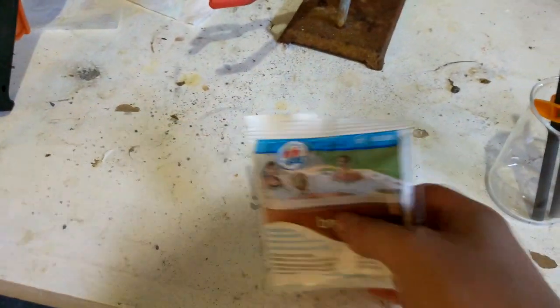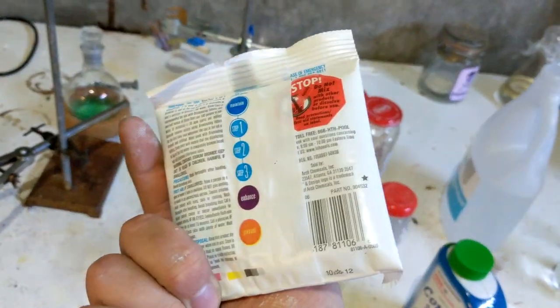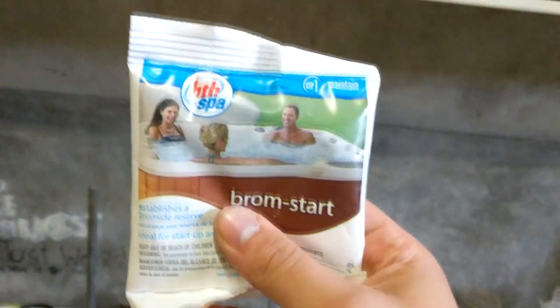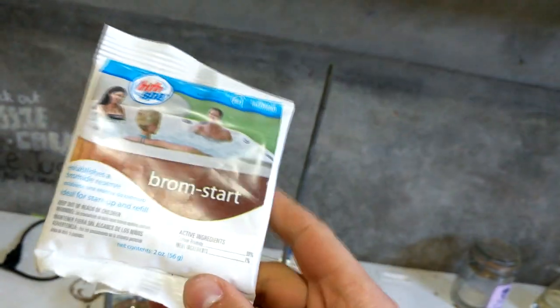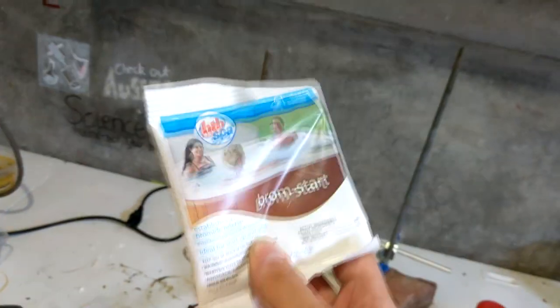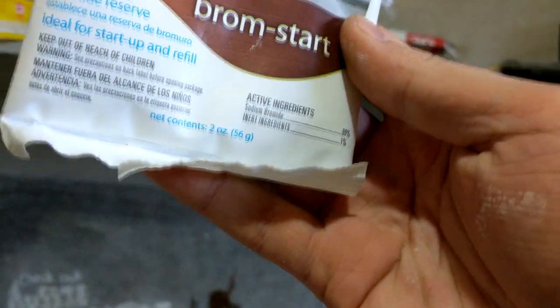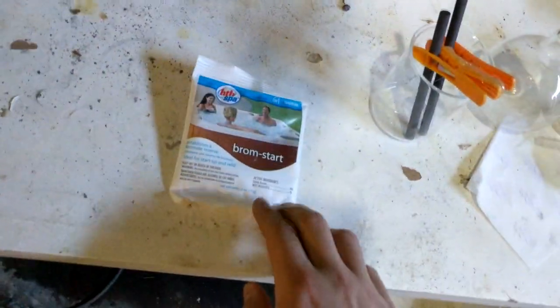Our source of bromide is going to be this product called Bromstart, which I think is a dreadful name. It contains 99% sodium bromide and 1% inert ingredients, which should be good enough purity since we're going to recrystallize everything later. This is a product sold for use in spas or something. I didn't buy this myself — it came from America. I don't believe sodium bromide is an over-the-counter product in Australia. Someone sent this to me last Christmas. It's about 56 grams per pack — two ounces — and I've got two of them, so that's about 112 grams total. I'll be using one pack.